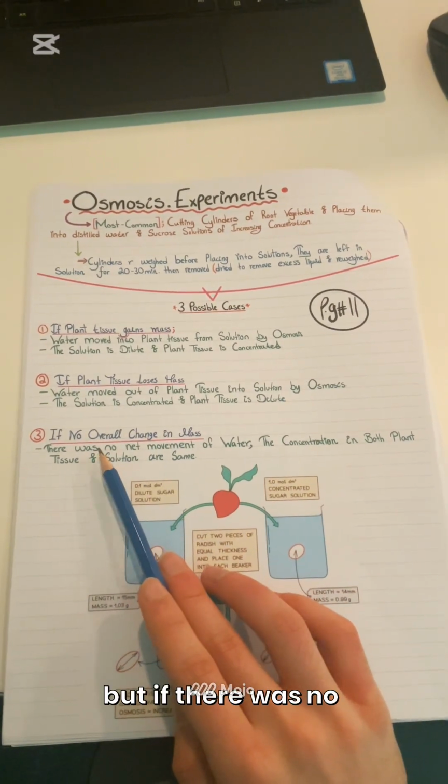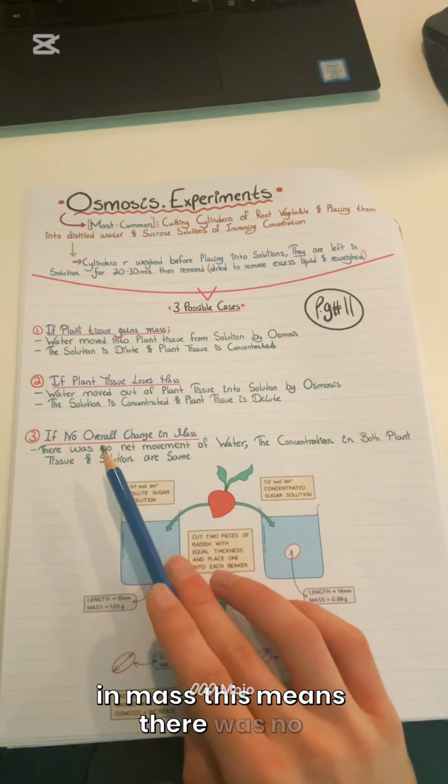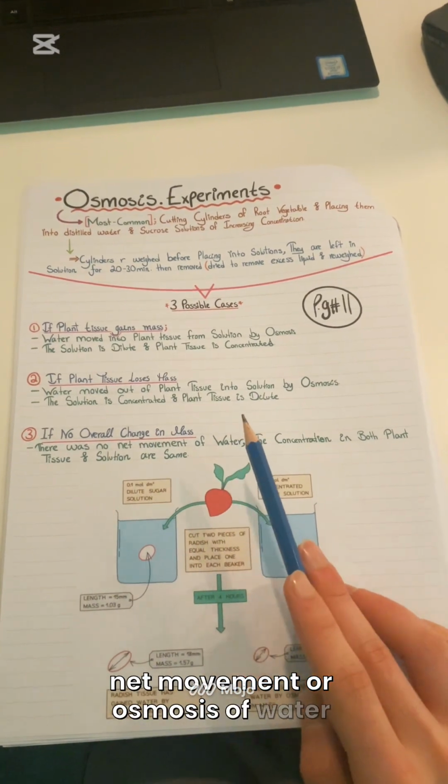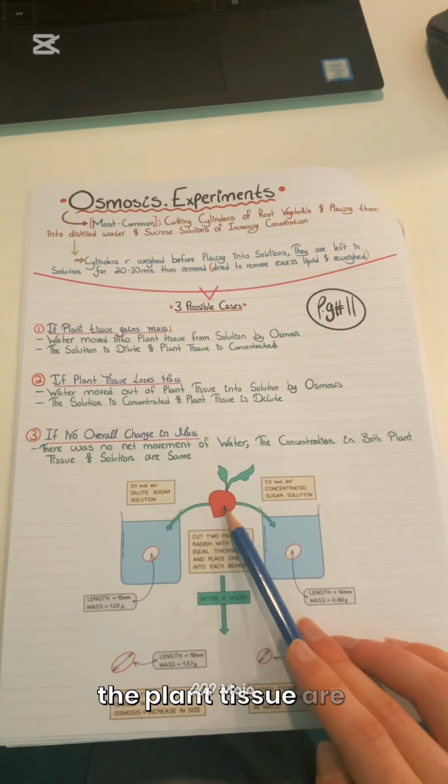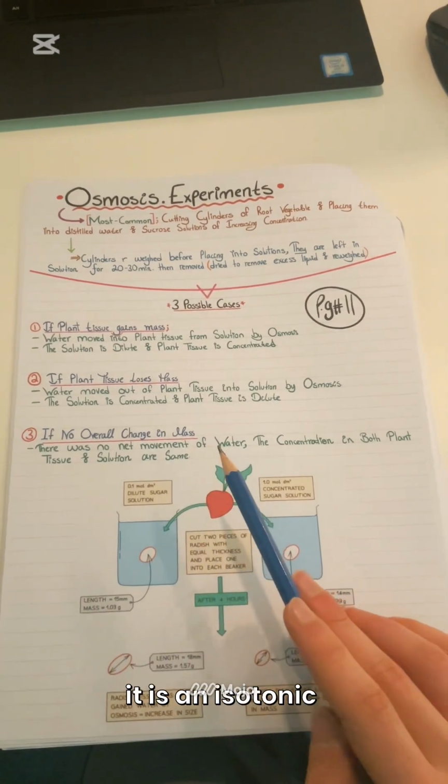But if there was no overall change in mass, this means there was no net movement or osmosis of water, and the concentrations of both the solution and the plant tissue are the same, and it is an isotonic experiment.